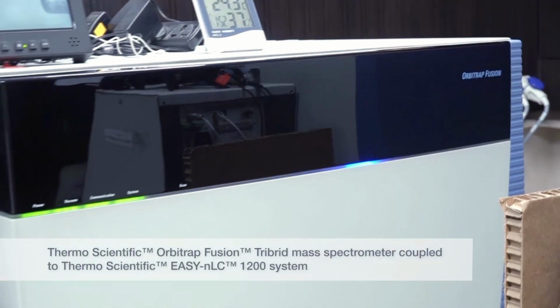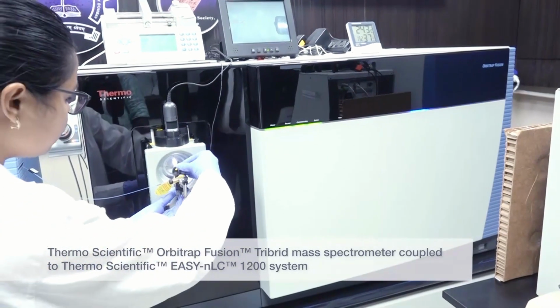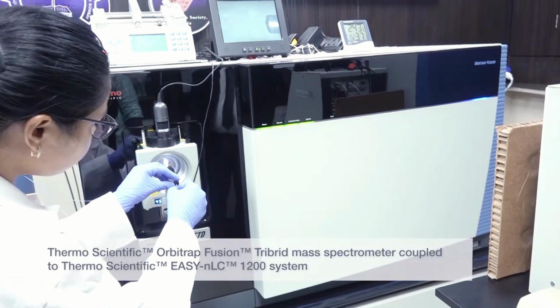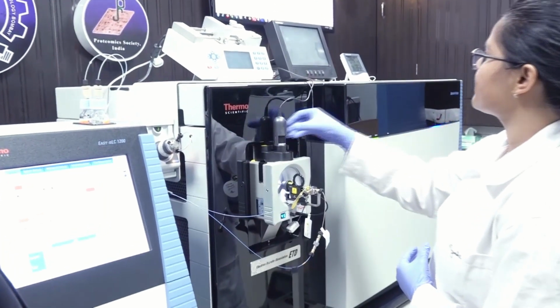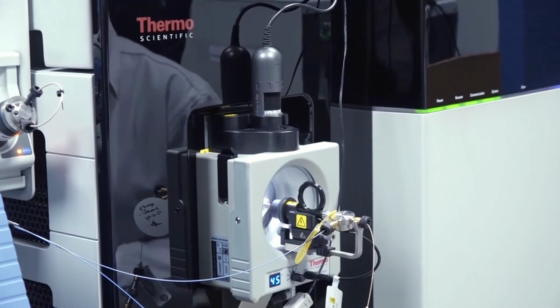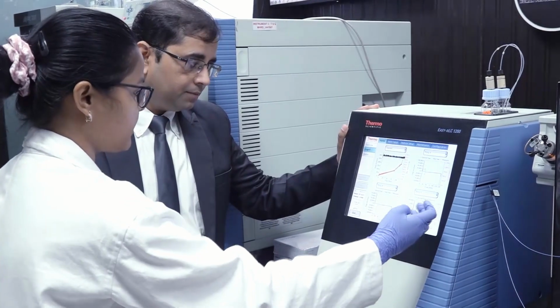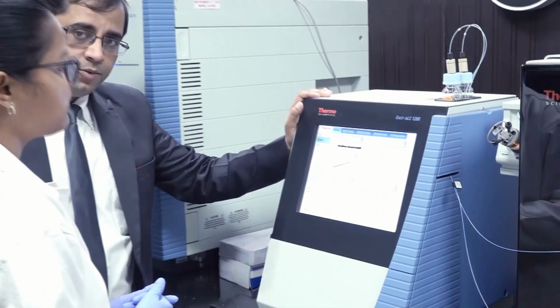We utilize high-resolution hybrid and tribrid Orbitrap LC-MS/MS platforms with inbuilt principles such as CID, HCD, ETD and ETHCD. The Orbitrap Fusion Tribrid Mass Spectrometer provides very high resolution, accurate mass measurement, wide dynamic range, excellent sensitivity and ready-to-achieve selectivity and advanced fragmentation options to separate these complex proteins. It uses different types of chromatography methods to optimize the gradients and utilizes different types of collision cell. And we try to get as many proteins as possible from these samples.